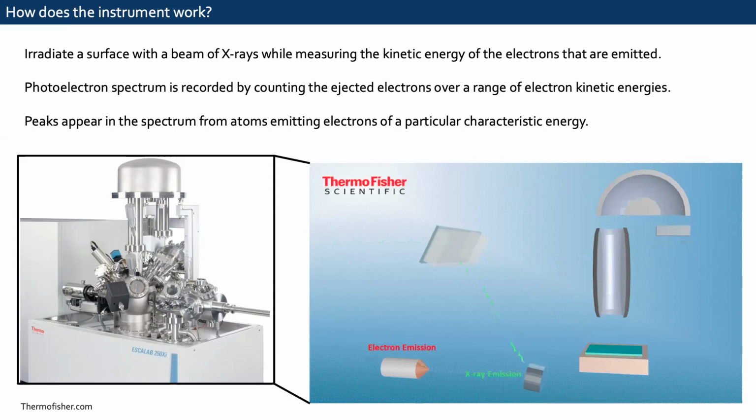I'm not exactly sure what Thermo Fisher is putting into their software for the exact work function, but I'm sure it's really worked out from standards. It might be backtracked by putting in a really high grade sample of silicon or something like that, and backtracking what the work function of the instrument is by looking at a couple of really high quality samples. That's what I would guess how they would backtrack out that work function, but I'm not sure. Makes sense. Yeah.